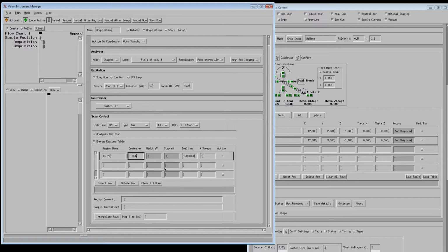If you are unsure of this, you can perform one acquisition before and find your peaks, and then grab the image afterwards when you are sure that you have the correct position for your center of acquisition. Then I press enter. For number of sweeps, I want 2 sweeps.